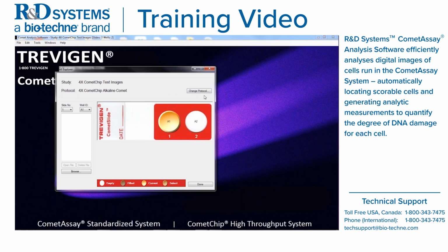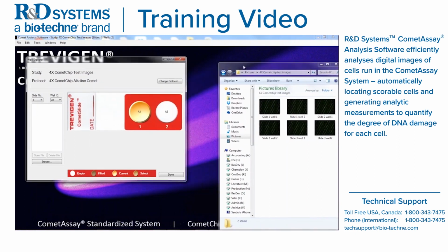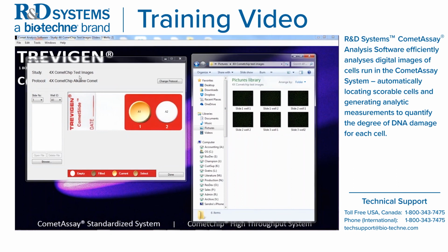All right, so let's go get our images, and we are going to drag and drop our images into the slide wells. So let's use Well Explorer. I have a set of images here. So in this window, you can see that you have slide numbers 1, 2, and 3. And since we did 2 wells, we have position 1 and 2. So it's very easy. All you're going to do is take your image, and you're just going to drop them in there. Then you will move on to your second slide. You're just dragging and dropping.